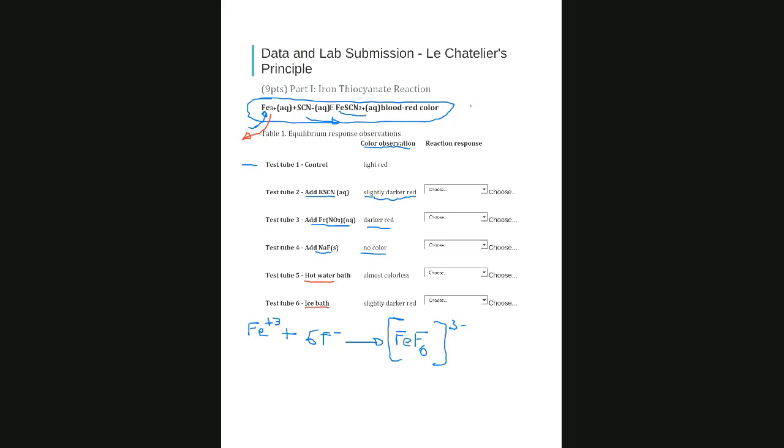They are asking in which direction it shifts. When you put that system at equilibrium in a hot water bath, the system changes color and has almost no color. Which side has no color, the reactant side or the product side?